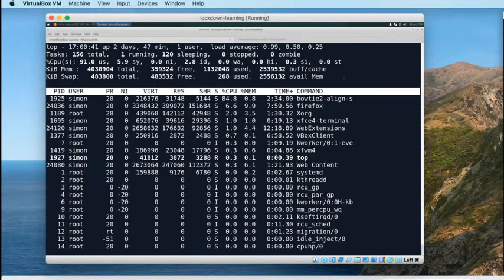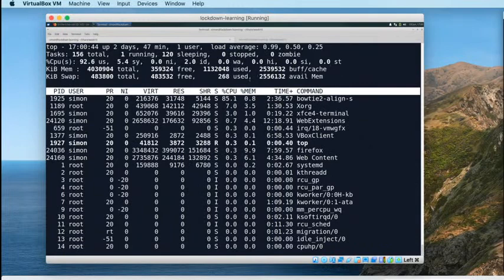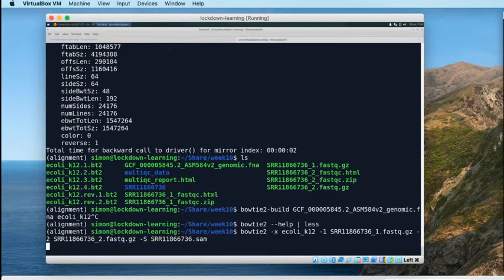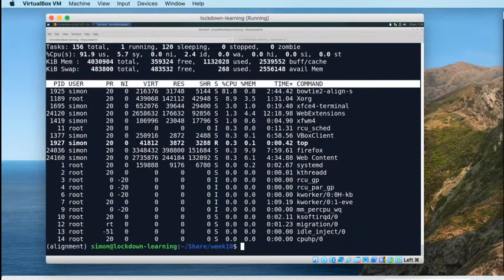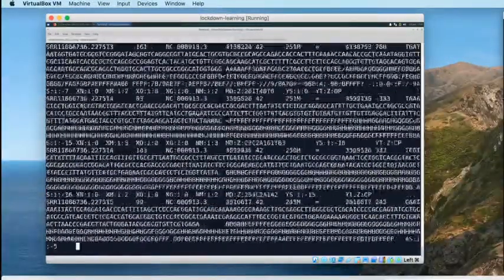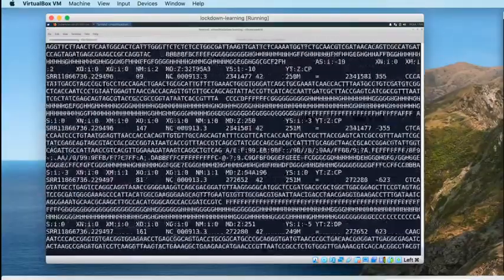So we're still going, 2.5 minutes in now, this is producing an alignment. Actually, we can maybe have a look at the alignment while we're going as well. That's another useful tip here. A function of the tail command is, if a file is being actively produced, you can use tail with the -F option, capital F, to look at the end of the file live as it's being produced. So we're producing a file which is srr blah blah blah .sam. If we use tail -F while that file is being produced, we can look at the end of that file dynamically.